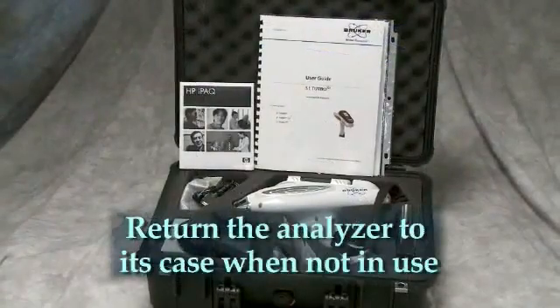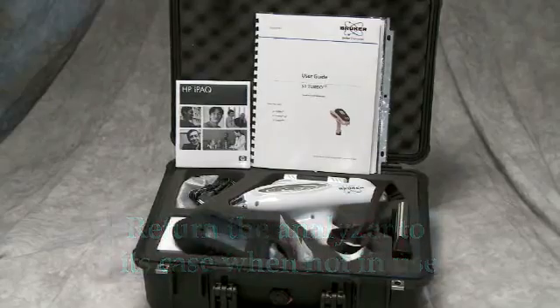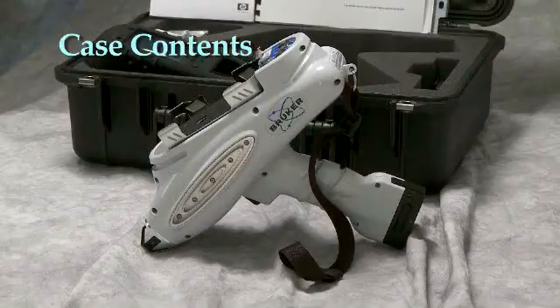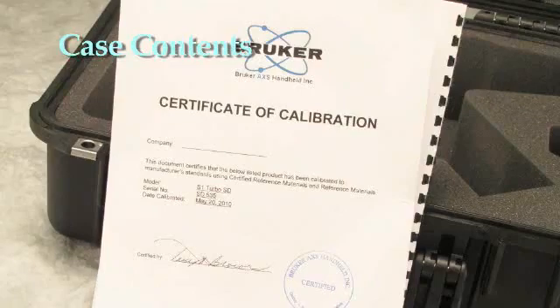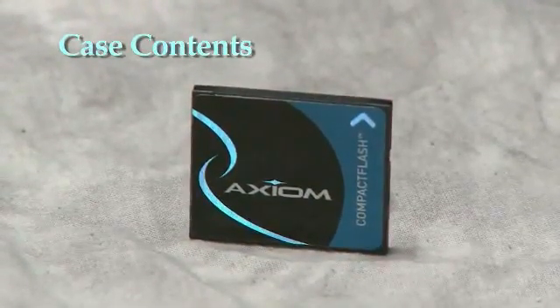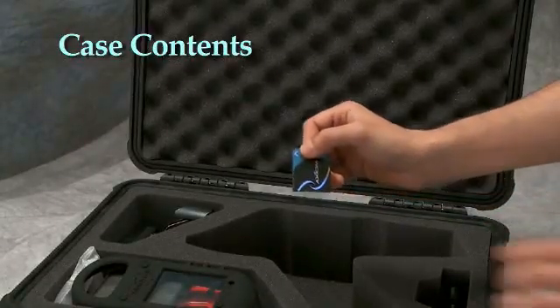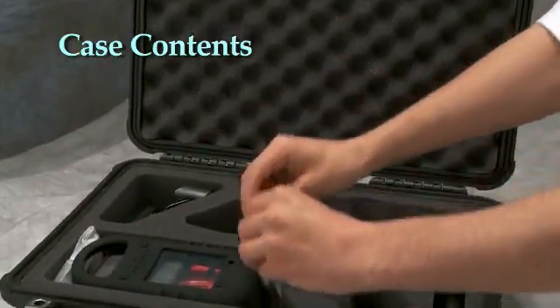The unit comes in a watertight Pelican case. Always return the analyzer to its case when not in use. In its case you will find the analyzer with a battery and wrist strap installed, a CD containing the user's guide and other files for your instrument, a calibration certificate for the analyzer attached to QC data for the 2205 check sample, and a flashcard containing the PDA software and calibration information. This flashcard should be stored in a safe place and only used to restore the software and calibrations when instructed to do so by Bruker staff.